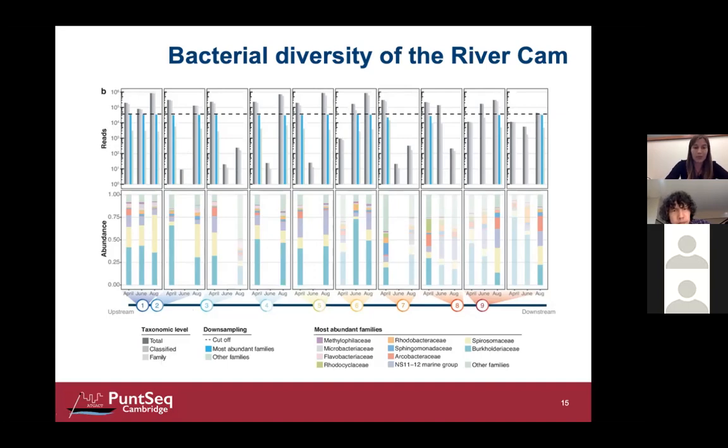But what is more interesting is that down here, I'm only showing the samples that had more than 100 reads in general. And the ones that had less than the 37,000 reads that I just said we used as a threshold, I'm showing them in a transparent way here, because we are not yet really going to use them.